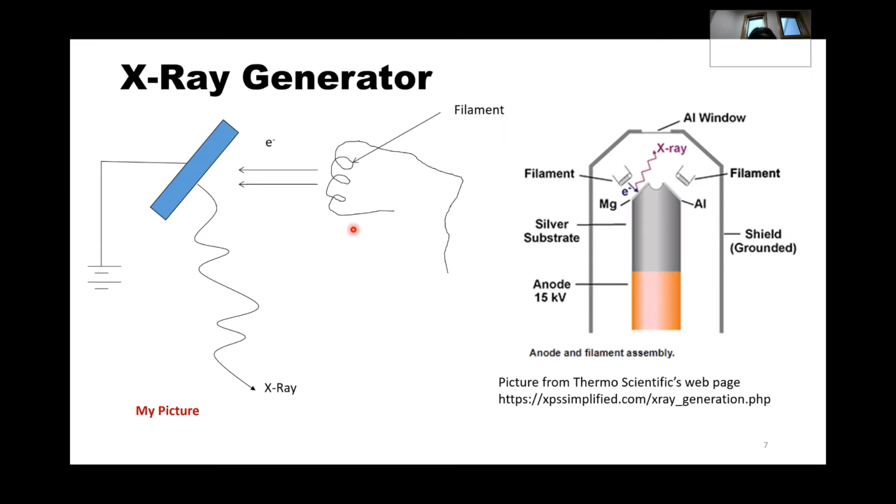So this is cool because Thermo Fisher has a variable wavelength technology, and the way they did that is they have two different target materials. Silver, why are you using silver? Silver is highly conductive, and then you have a connector, an anode that connects to it. And this is the cathode. So cathode, anode, thermionic is a hot cathode technology, very similar to vacuum tubes and that kind of thing. You emit some electrons.